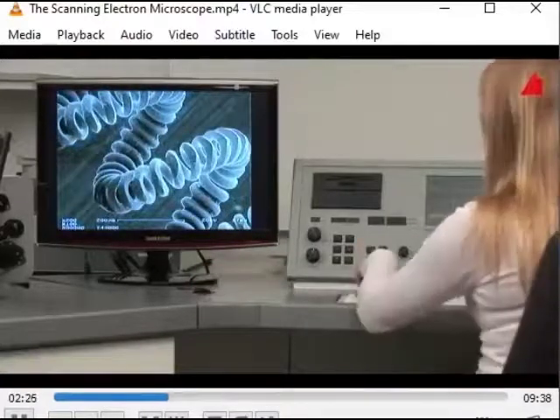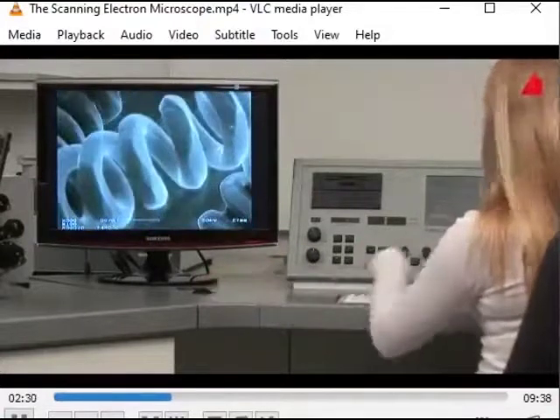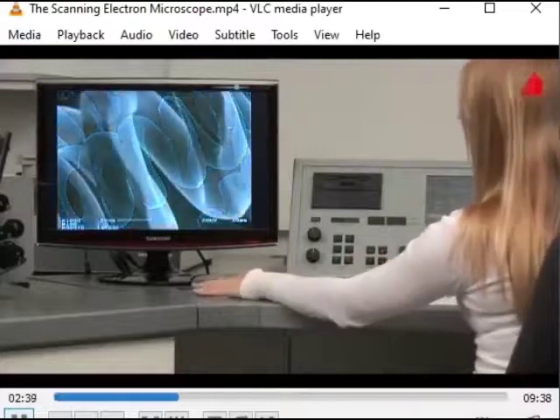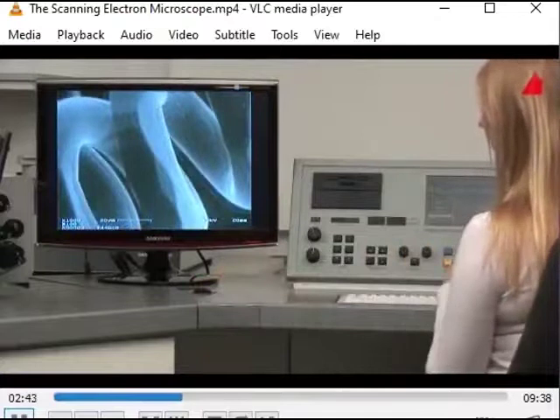Originally, the coiled filament was quite smooth on the surface. Caused by the everyday use of the filament, new crystals have been formed. Tungsten atoms have evaporated and the outer regions of the filament have become polygonal. But how is this plastic image generated, and how does the microscope actually function internally?